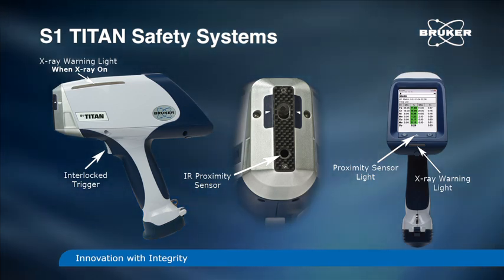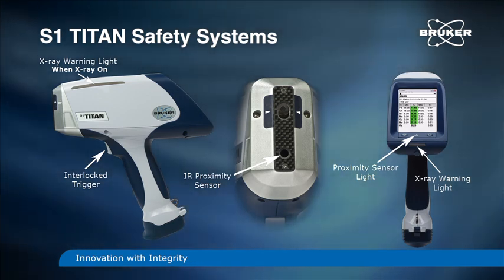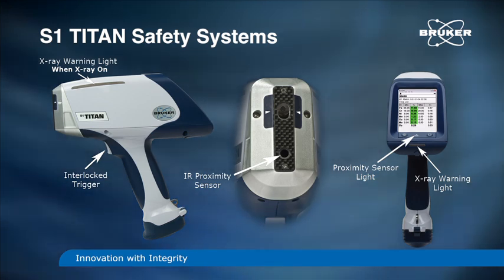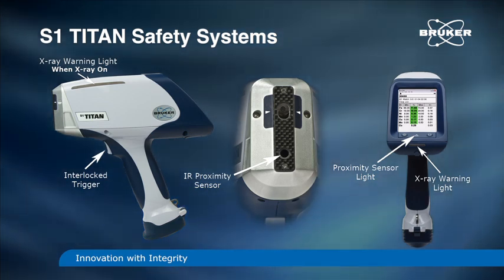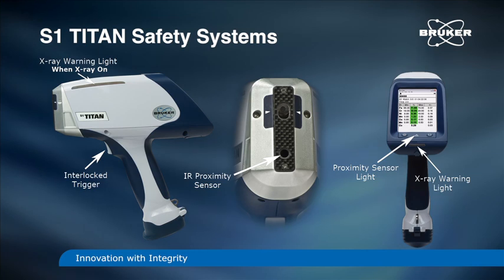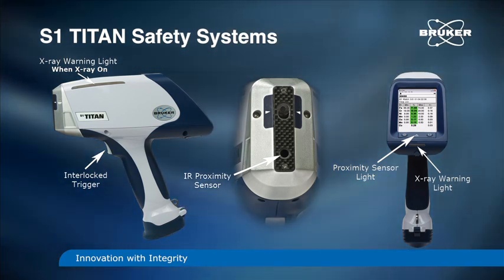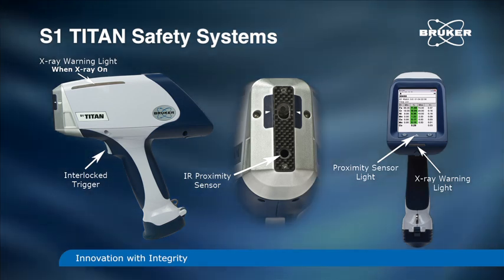If the analyzer remains idle for a set period, the program will require the operator to log back in, restoring the previous session. These controls are designed into the XRF analyzers for your protection. Do not defeat or tamper with the interlocks or the fail-safe systems.